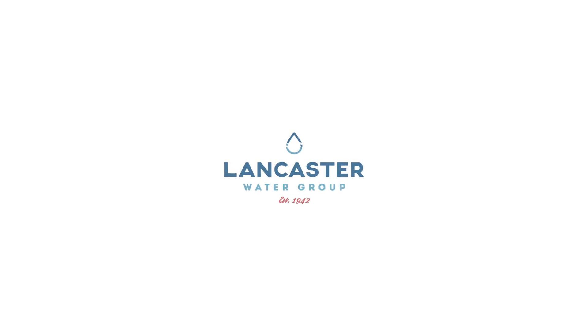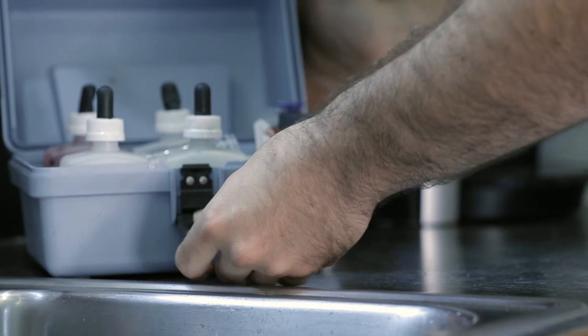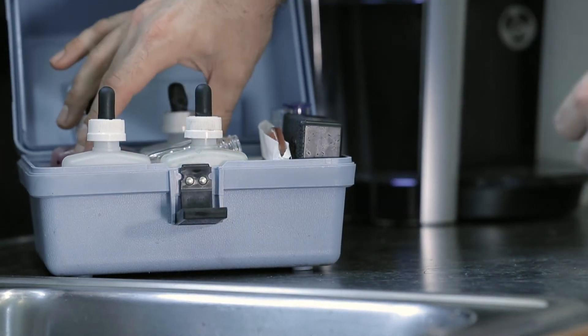Today at Lancaster Water Group, we will be discussing the HA-62B Hawk Water Test Kit that we sell. To begin, let's do the hardness.